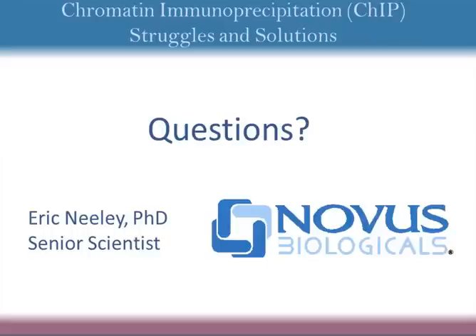Okay. So we can just squeeze in one last question, and we'll go for the one from Tomohiro Masuda, and he's asking, is there any way to find out which antibodies will work for ChIP? Is there a list of validated antibodies somewhere that can be accessed? Yes.